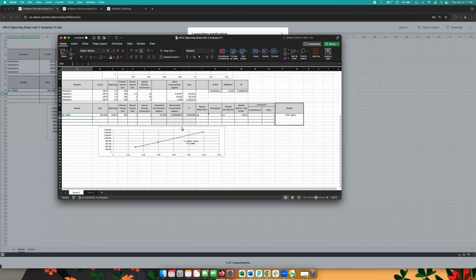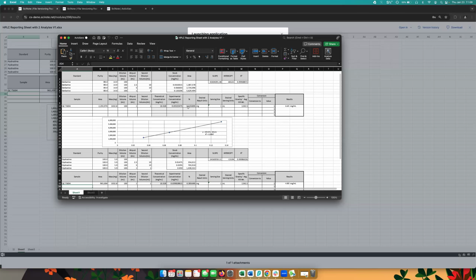But anyways, we've got this Excel file here, and let's say I modify some of these data points here. The change itself is not relevant, so I'm just going to make some changes. And it's important that after you make these changes, that you save these changes. And you want to save it to the same file that you're working in.